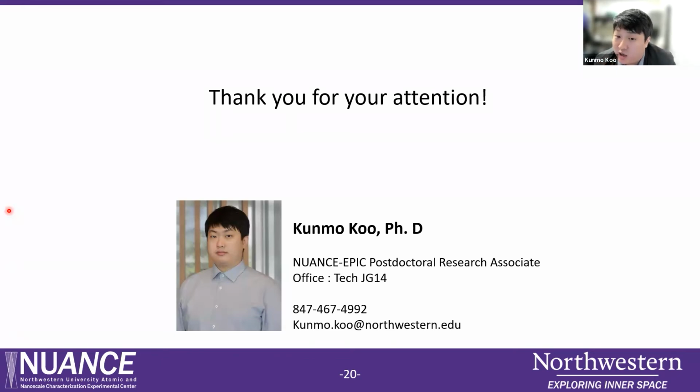For the pressure, I don't have an exact number because there is some argument between researchers about the van der Waals force between two graphene layers. Some people are saying it is causing a pressure buildup inside the cell, and other people say that amount of pressure is not really big. But actually, we don't know exactly what the pressure is inside the graphene liquid cell because there is no way to measure the pressure inside a tiny attoliter-sized graphene liquid cell.